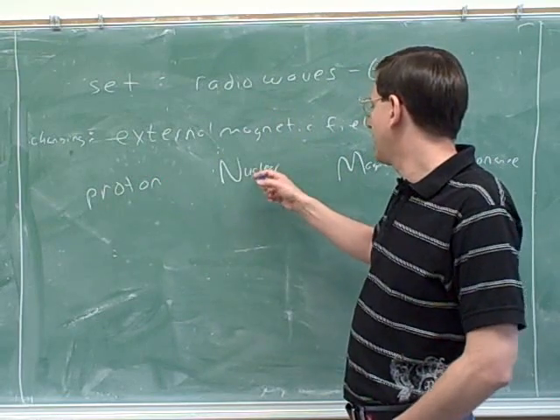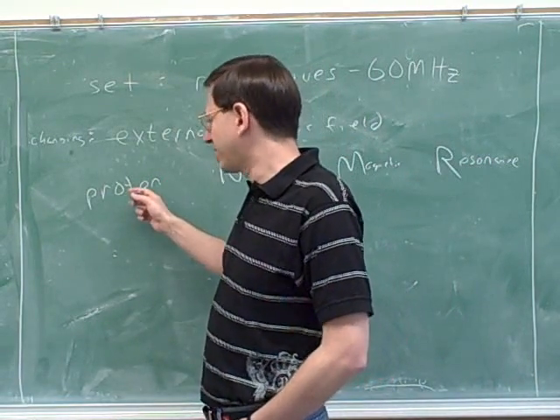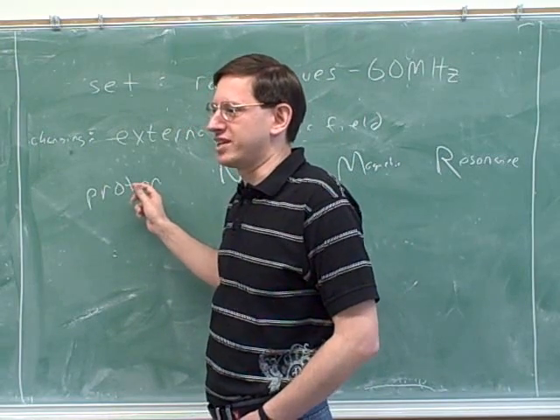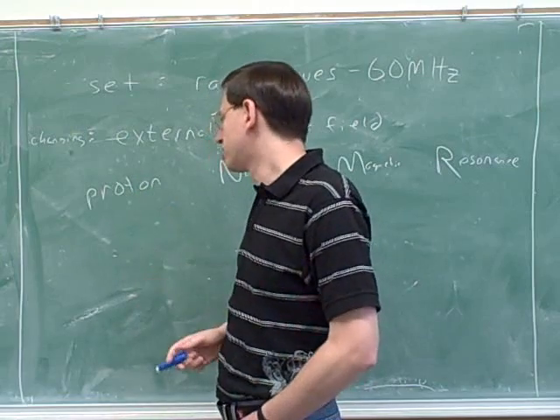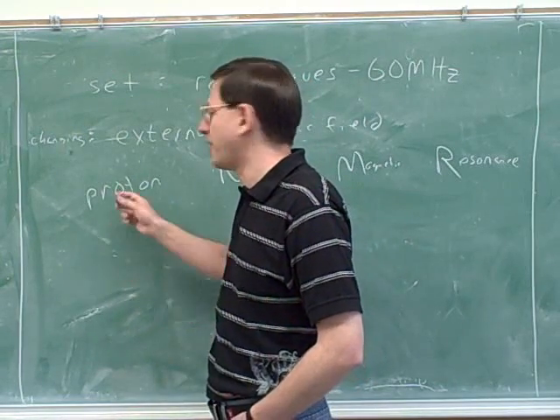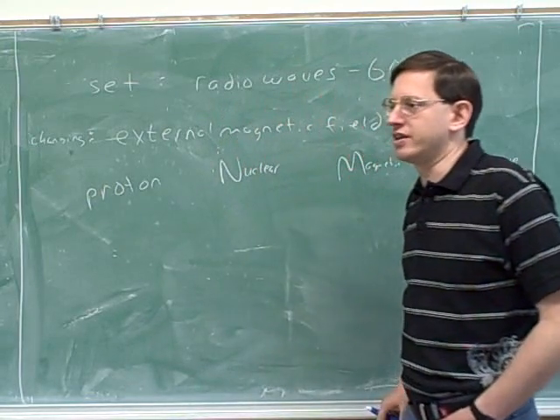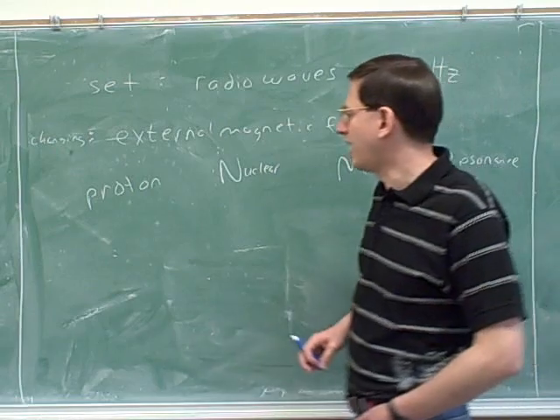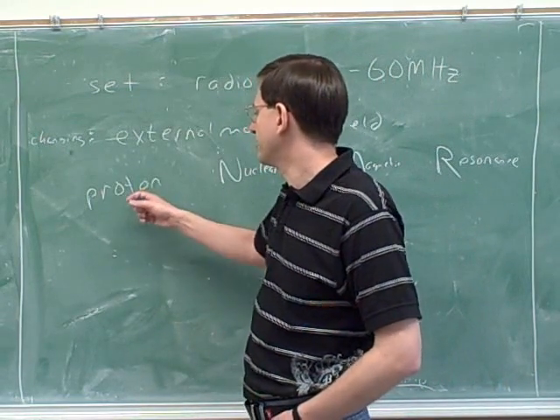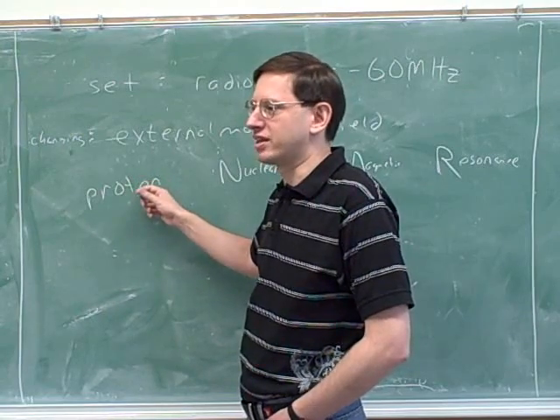Put another way, it's called proton NMR because we're focusing on the hydrogen absorptions. And people oftentimes call hydrogens protons, loosely speaking. So what we're really focusing on is the absorptions by the hydrogens. That's where the word proton comes from here, because proton is often used as a kind of synonym for hydrogen. There are other types of atoms that can also have absorptions, but we probably won't get to that today. But proton NMR is the key.